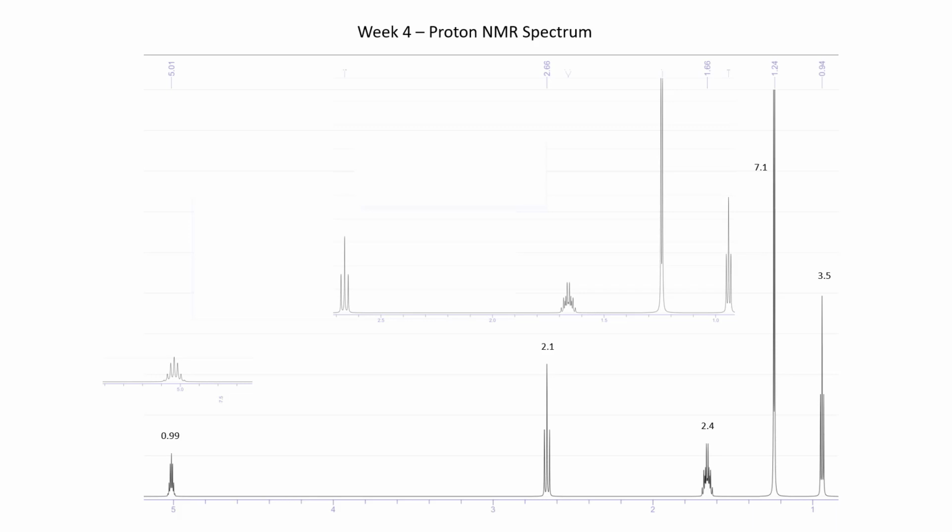Okay, so what I have is a structure that I put into my iPad, and I used a program called Orange NMR, which I believe is free, and it predicted the proton NMR spectrum for me. These numbers here are my integration values that you would normally see in all of the problem sets that I gave you that actually had numbers.